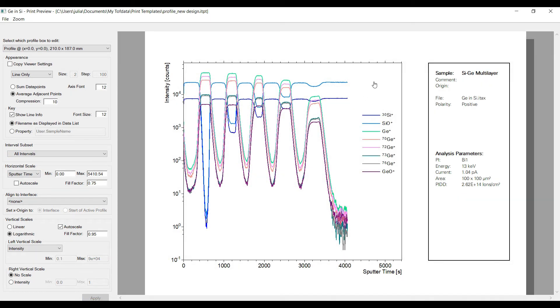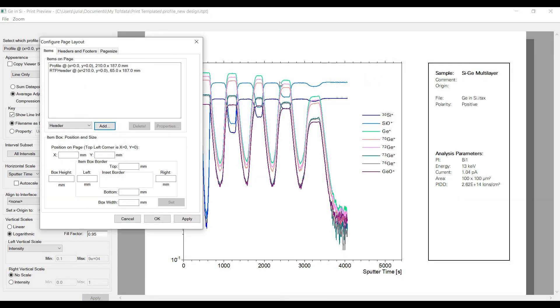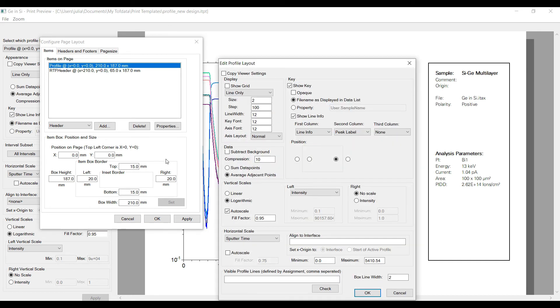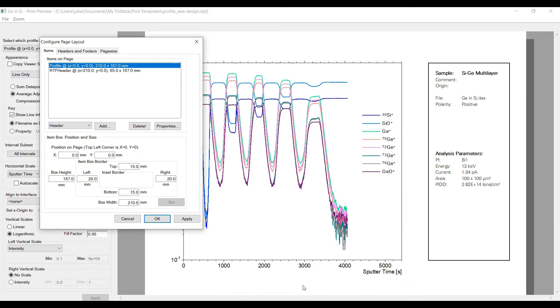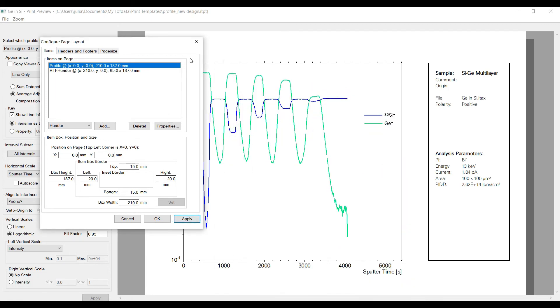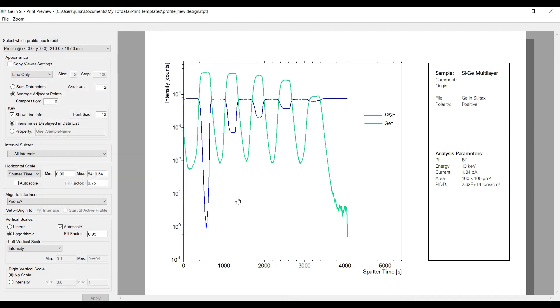But there is another possibility to print only a selection of mass intervals directly in the print preview. Open the profile properties with a double mouse click and type the assignments of the desired mass intervals in the respective field at the bottom of the dialog.